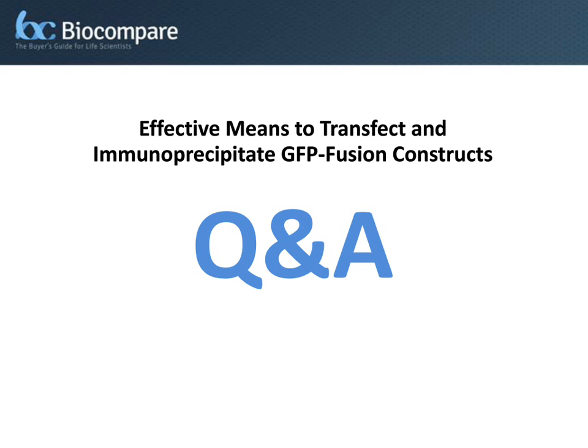Okay, Tina, we're going to actually stay with you. What could be the explanation of additional bands which we observed on the western blot of GFP-trap in a time course experiment? Well, this is a pretty difficult question, not so easy to answer. It might happen that the protein is degraded during the time course. I would need to check the procedure of the experiment directly with the person, because if they just take out samples, let's say after 5 minutes or 30 minutes, and the protein is very unstable, then it might happen that the additional bands are degradation.